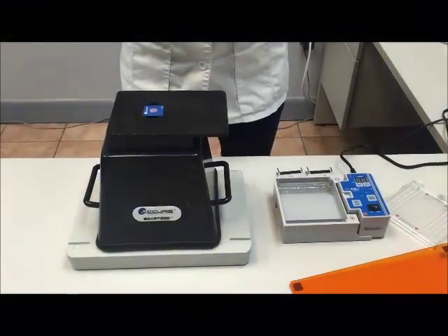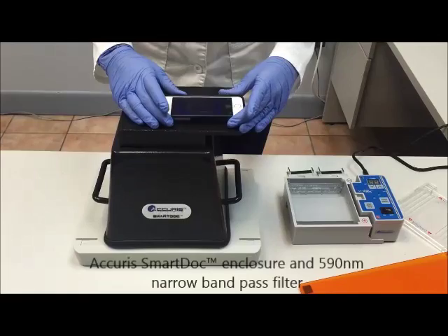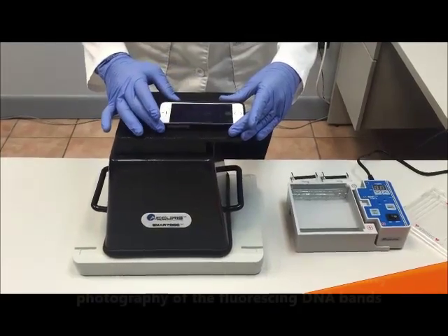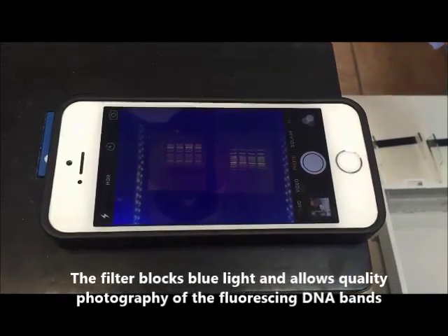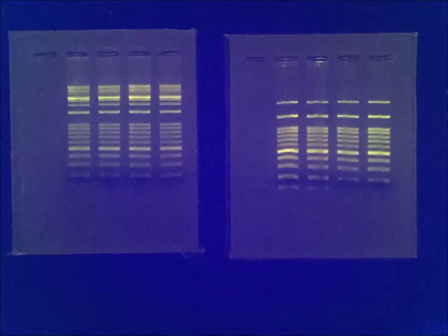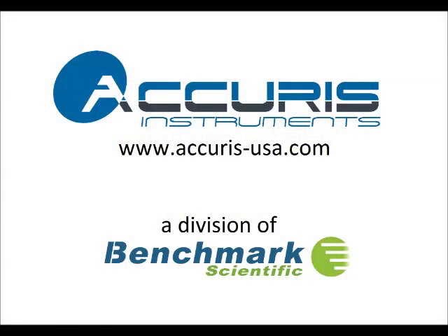Our final step is to document our results by taking pictures of the gels. We're using the Accuris SmartDoc Imaging Enclosure and a 590 nanometer narrow band pass filter. This special filter blocks the blue light and allows high quality photography of the fluorescing DNA bands using an iPhone or other smartphone with camera. For additional information, please visit our website, accuris-usa.com.